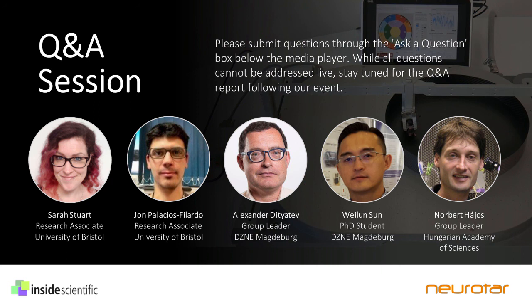One thing that we're looking into now is whether training the animals in that task freely moving first, before they undergo any surgery and then head fixation, will translate well enough such that they don't require as many training sessions in head fixation to be able to perform the same task in the mobile home cage, which should help with training.